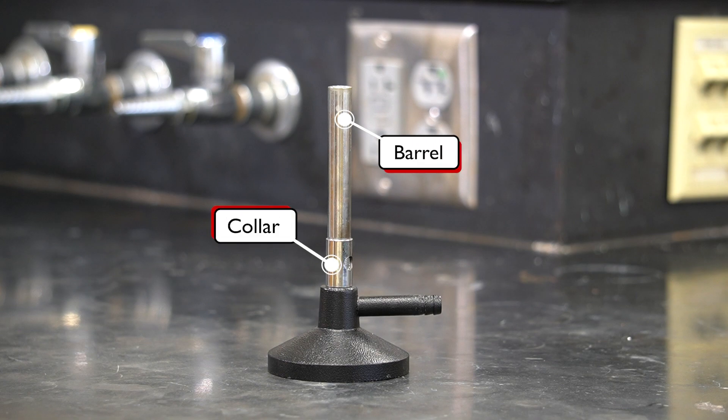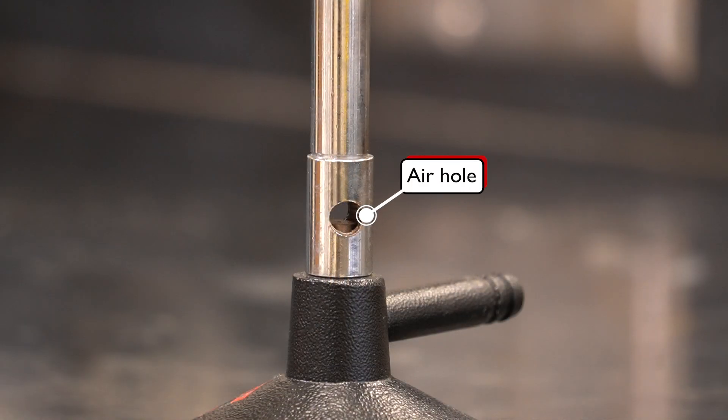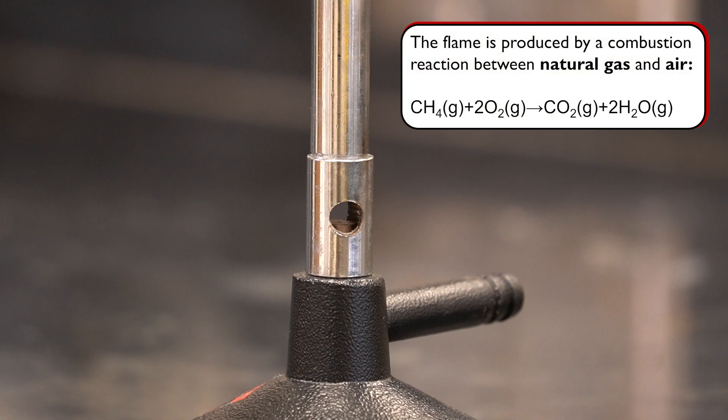Down here is the collar, which wraps around the bottom of the barrel. There is a small air hole on the side of the collar that allows for air to enter the burner. As the flame is produced by a combustion reaction between natural gas, methane, and oxygen, supplying sufficient air flow ensures a complete and hot flame.